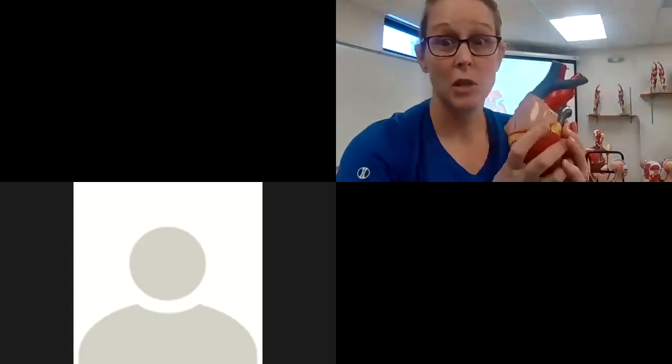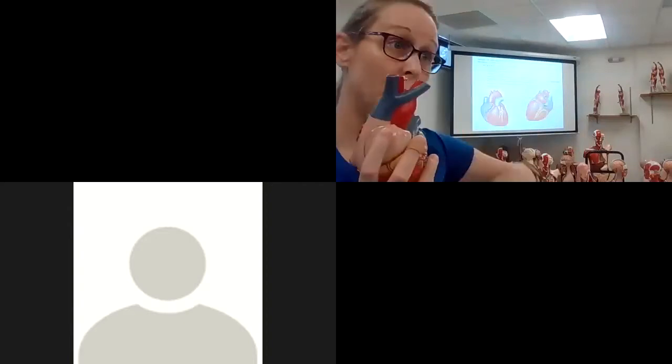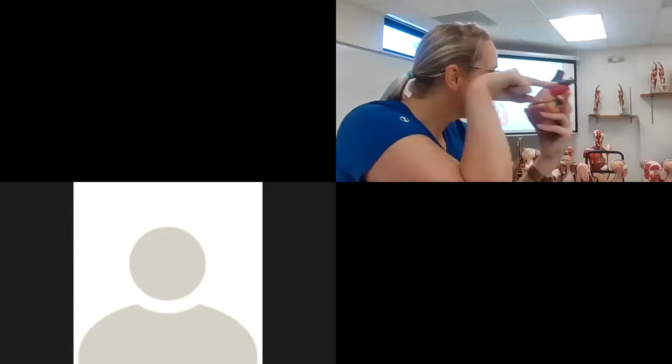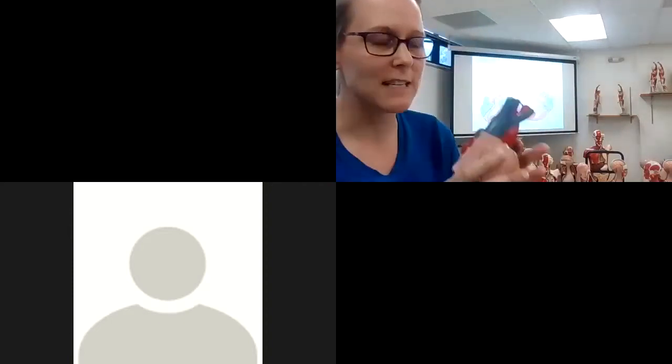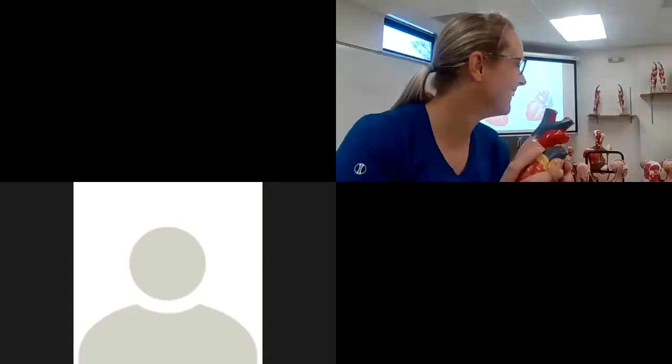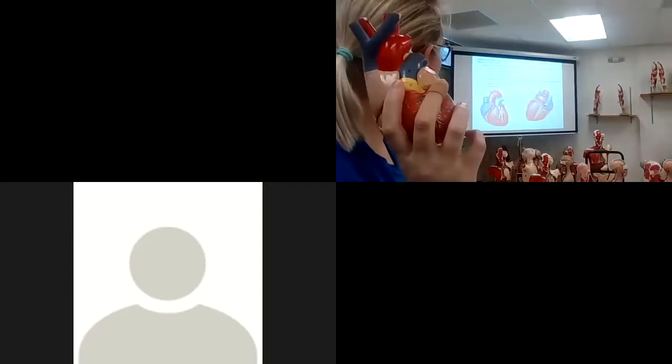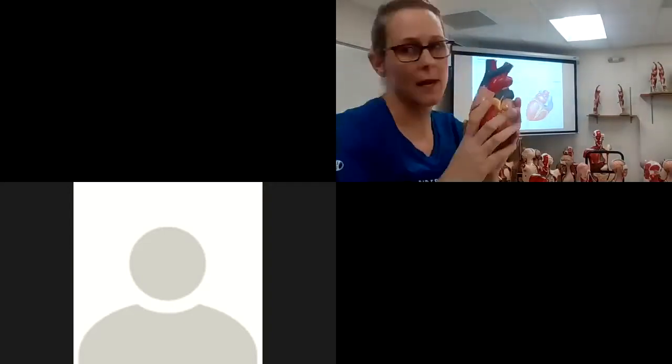So when I used to do a lot of rat work, and we wanted to put a probe in the left ventricle to get pressure changes in the left ventricle, we would go in through the left common carotid. And those are small vessels. So it was tiny little probes going into tiny little vessels. And you didn't want to cut too much because then you cut the whole vessel. All right? Okay, so that's some of our major veins, major arteries, base apex.